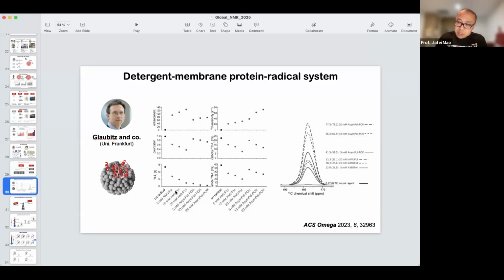But if you go above 30%, the glass will not be perfect, but it's more or less there, so it's already enough to run the DNP experiment. We actually did this test a long time ago. And the advantage of using a lower concentration of glycerol is that you can pack more sample in the same rotor. So that's a few boundary conditions I can give as a tip.